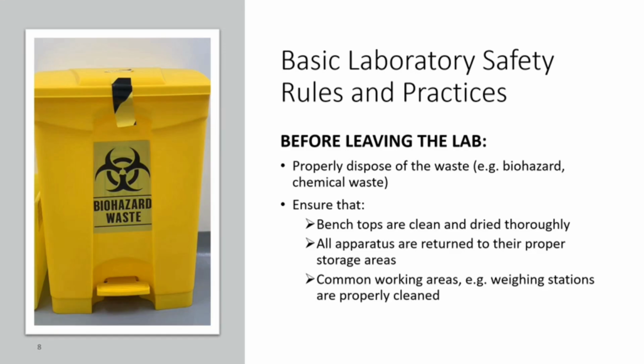You should also apply good housekeeping. For example, your own bench top should be cleaned and dried thoroughly. The apparatus should be cleaned and returned to the proper storage areas. You should also maintain the cleanliness of the common working areas. For example, the weighing stations should be properly cleaned.